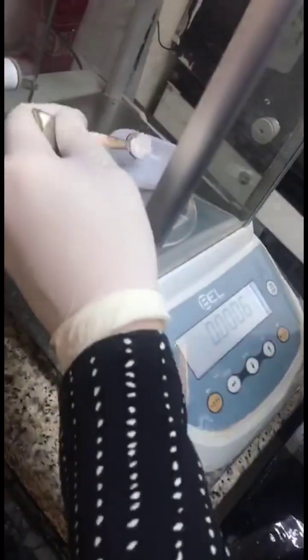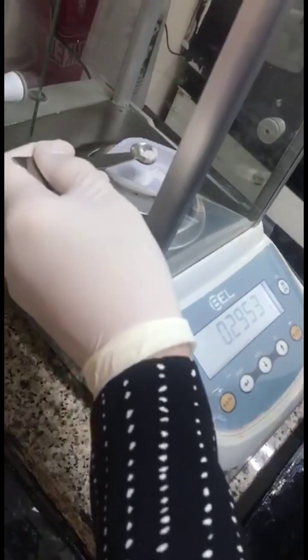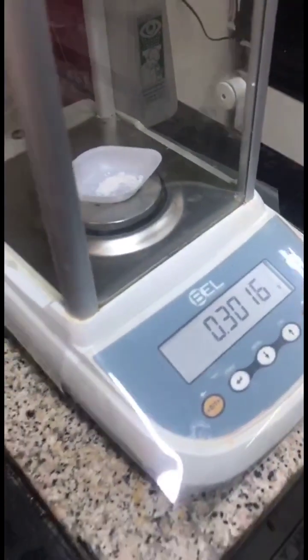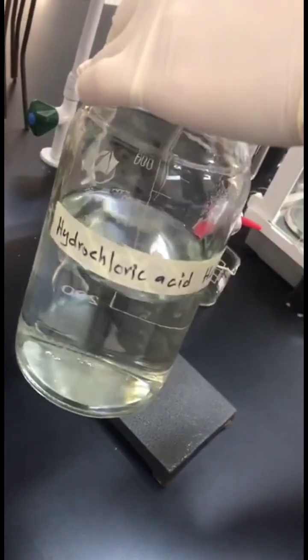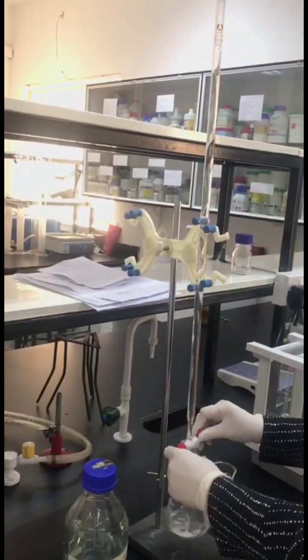We are going to weigh 0.3 gram of our analyte, calcium carbonate. We'll transfer our sample of calcium carbonate into an Erlenmeyer flask. We add to our burette 0.1 molar HCl, so it is our titrant. We will add 50 ml of HCl on our sample.